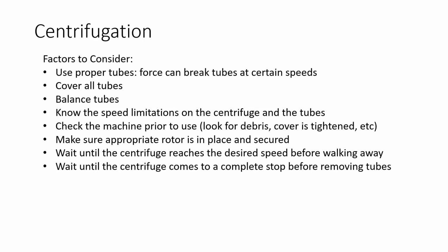So a story from when I was working in the clinical lab, I was in specimen processing at the time, and one of my colleagues thought it was funny to put a glove with some dry ice inside of it and put it in the centrifuge so that it would pop and I would hear the noise and freak out about the centrifuge. Obviously that person got let go for not following appropriate protocol, but I hadn't looked in the centrifuge and it didn't make a loud popping noise. I think I had stepped away. So this glove was still inside of the centrifuge when I went to go start it. Luckily, I remembered to look in there and I pulled the glove out, but that's something to keep in mind.